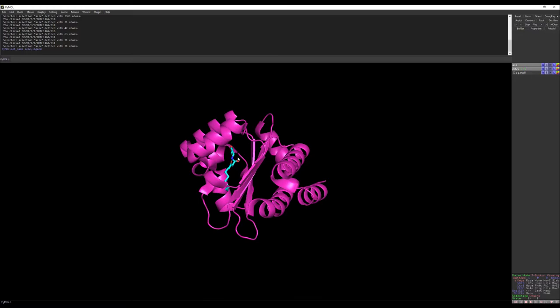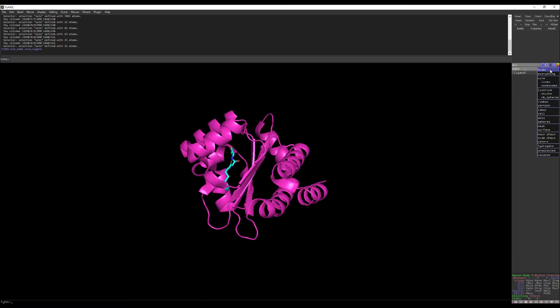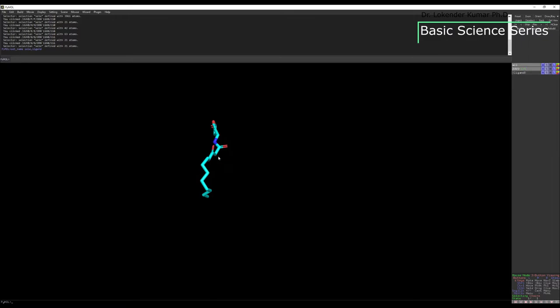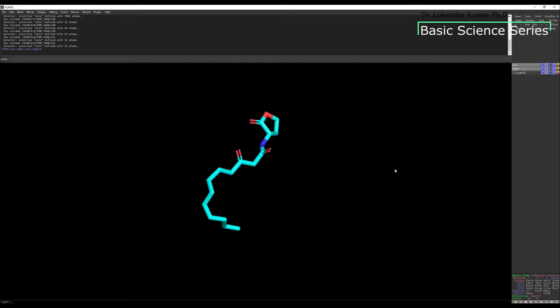Now what you need to do is hide the receptor protein so that you can only see the residues. Go to the structure, then H — H means hide — and then hide cartoon. Now you can no longer see the cartoon representation of the residues. Now I'm going to use the specific command to extract the information.